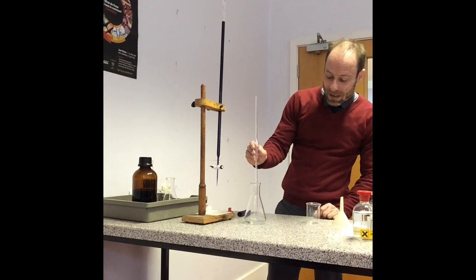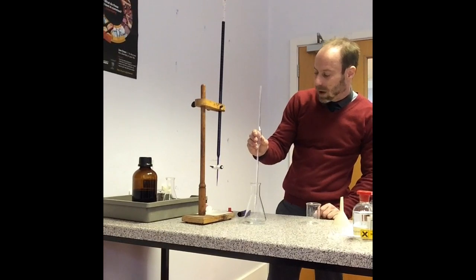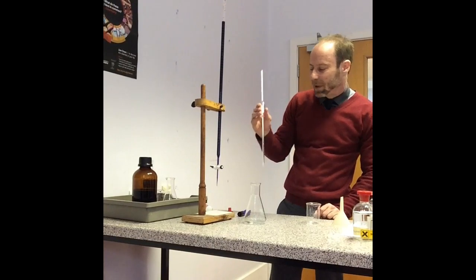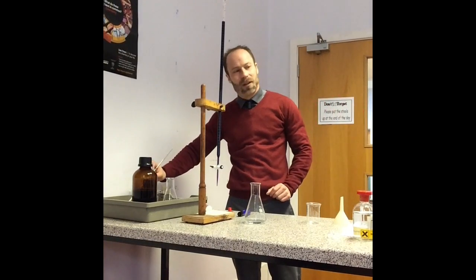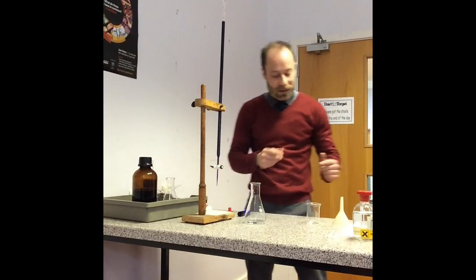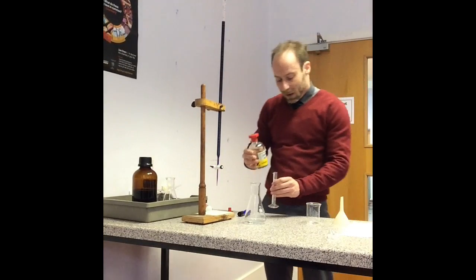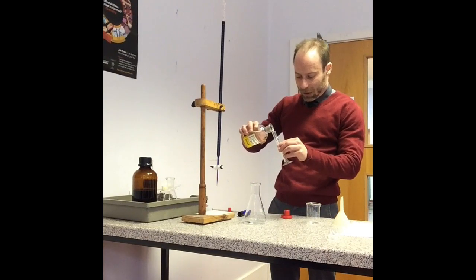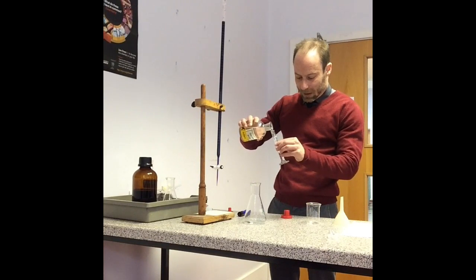This has actually already been acidified. Can anybody think why? This is an iron 2 solution, why it's been acidified. What happens to iron 2 if we leave it sat around over the weekend? Yeah, it becomes iron 3, so we need to put some acid in to just stop that. Right, so a little bit of sulfuric acid in. You need to do this because otherwise your titration won't work. It's a common error that people say, it's not worked.